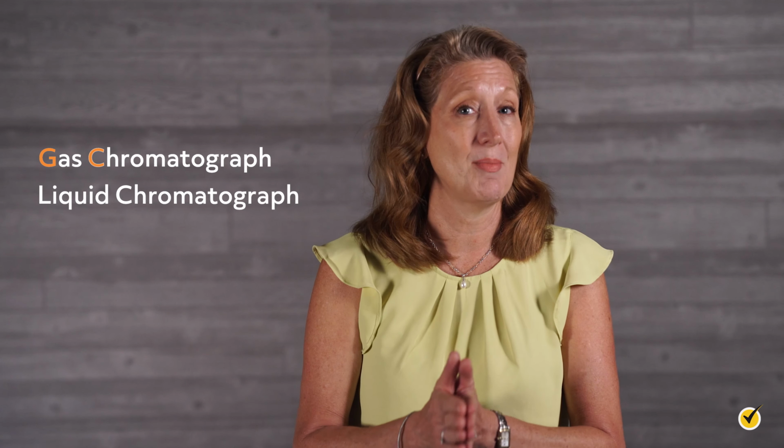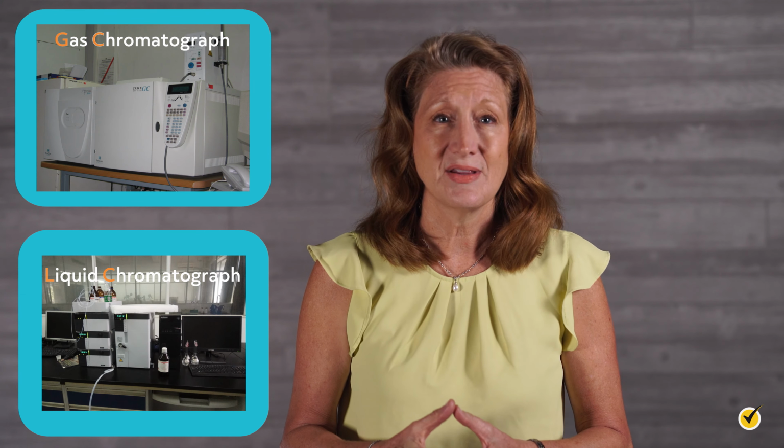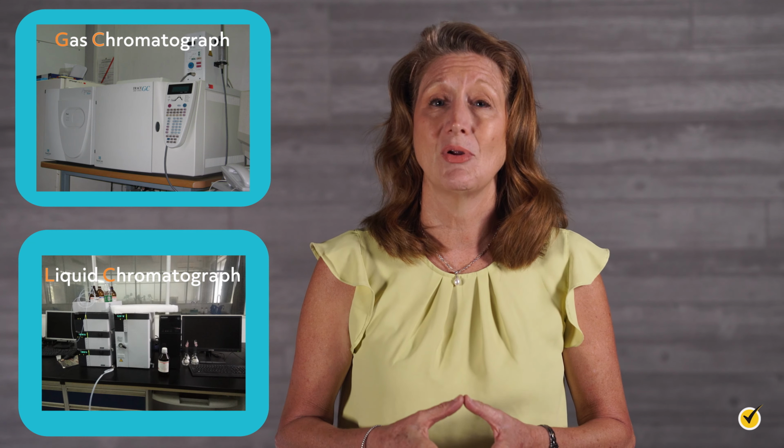Another critical choice in selecting the best chromatographic method is whether to use gas or liquid for your mobile phase. This is actually the categorization most often used for chromatography because this will determine the instrument required: a gas chromatograph, GC, versus a liquid chromatograph, or LC. These are exceptionally powerful instruments and are often automated to run hundreds of samples a day.